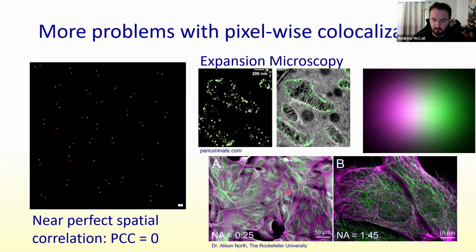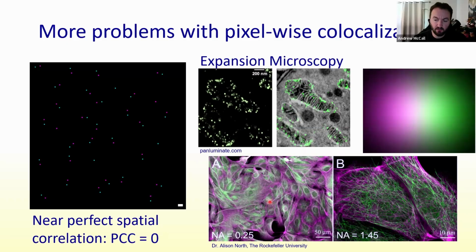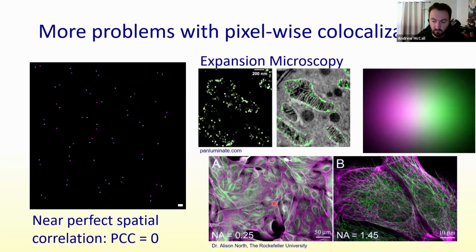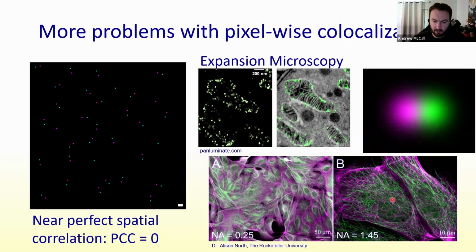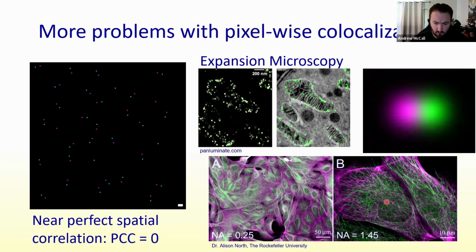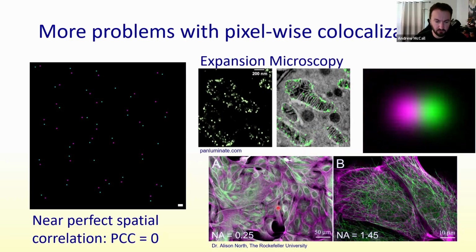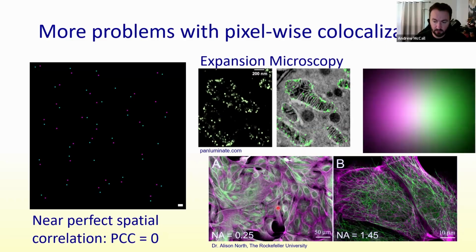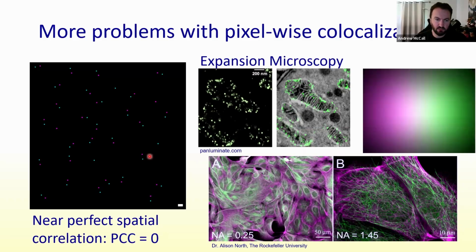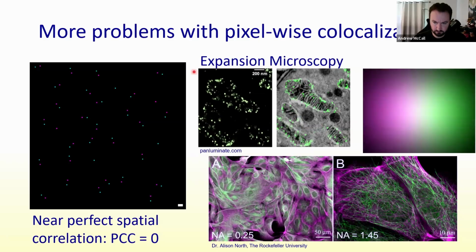Inversely, if you take low resolution or poorly imaged samples, like this one, you are actually able to more easily get a positive correlation result with this, even though underlying that there is no real spatial correlation between those two labeled structures. What this means is that we can easily get a false positive with a low resolution image with no underlying correlation, and a false negative when we have a high resolution image and perfect correlation. So how do we fix this problem?